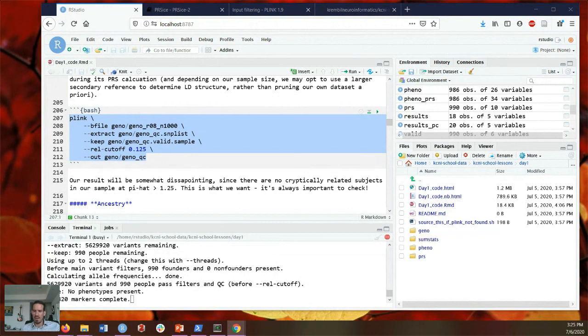So Jamie started 5 minutes ago and is at 3.7 million. Okay, well, chugging along. I'll probably end up killing this and going a long way around. The best part is that I have it in the notebook here.